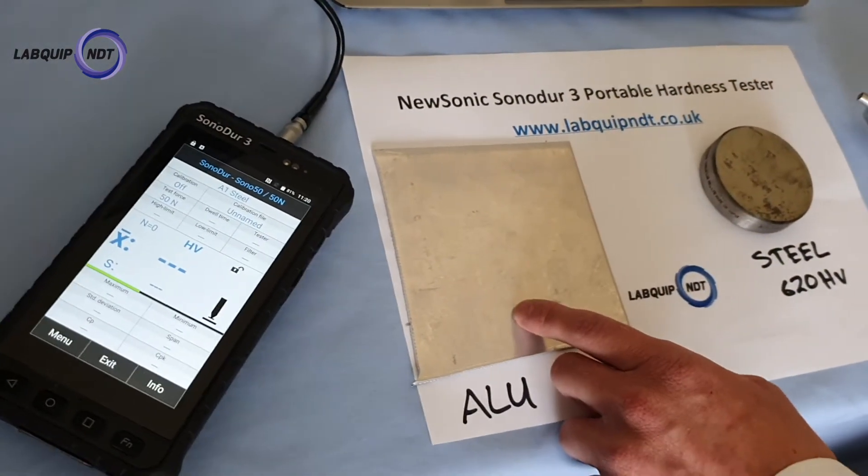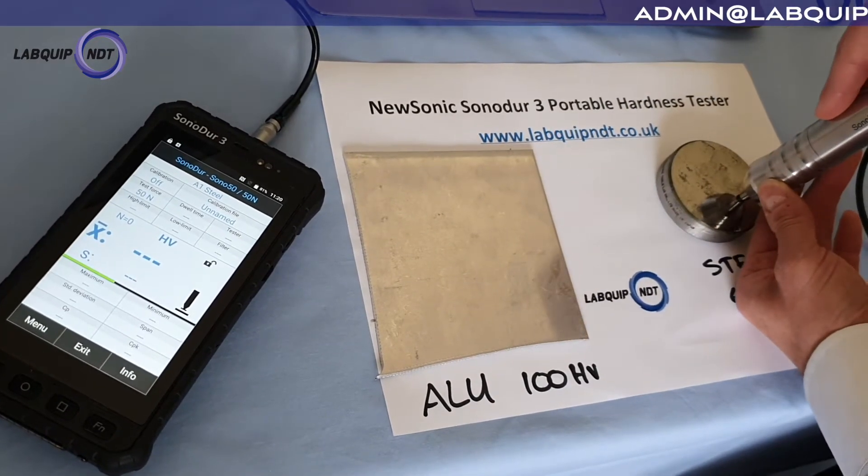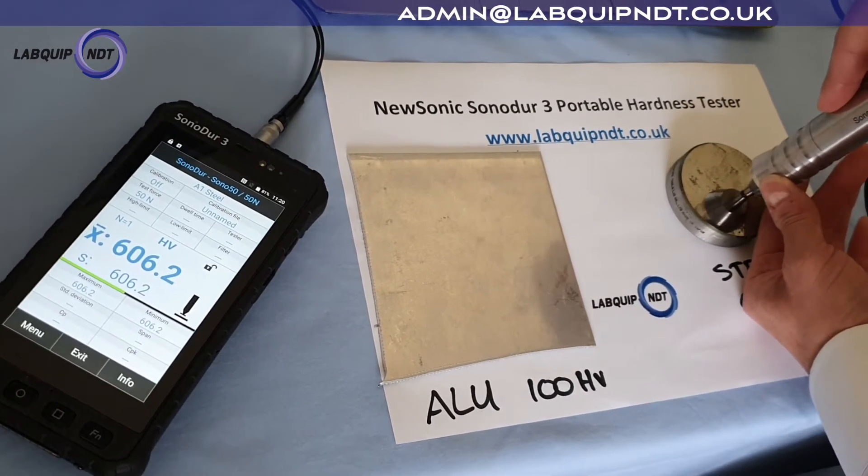We've also got a sheet of aluminium as well we can do some tests on. So I'm just going to go straight down onto the block and start acquiring some readings.